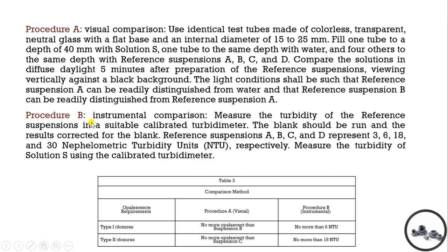For instrumental comparison, we measure the turbidity using blank (water) and collect results for reference suspensions A, B, C, and D, representing 3, 6, 18, and 30 NTU respectively. For Type 1 closure suspension, turbidity should not be more than 6 NTU, and for Type 2 closure suspension, not more than 18 NTU.